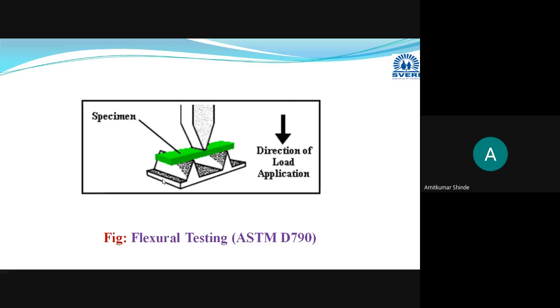If someone is aware about this ASTM, please put that in the chat box. Okay, no one is providing a reply. It is American Society for Testing and Materials. Okay, ASTM standard.